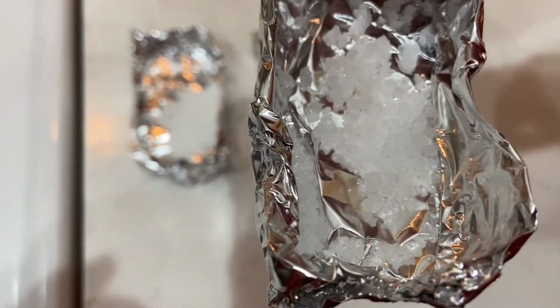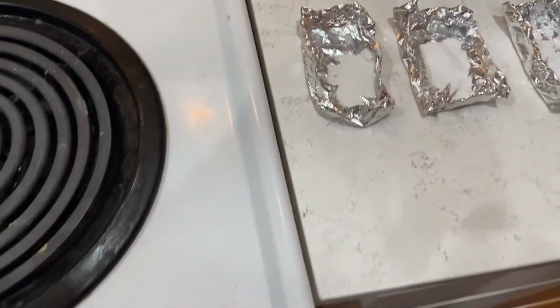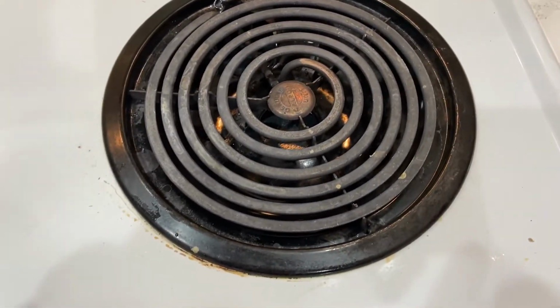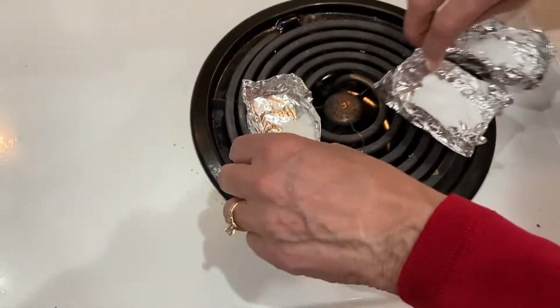I put about 2.5 milliliters of each substance in aluminum foil pan. And so what we're going to do now is compare their melting points by putting these all on a burner at the same time and observing them carefully for what happens. Here we go.